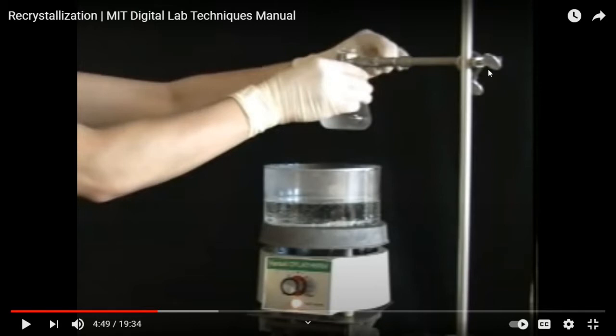This person is using this arm clamp, holding it to put it in the boiling water. Also, she doesn't put the flask right on top of the hot plate because it's going to boil. Boil means evaporation. That means gas comes out. Gas is heavier than air, so it will drop on the hot plate, catch fire, kaboom. Not good, right? So you're going to have water.